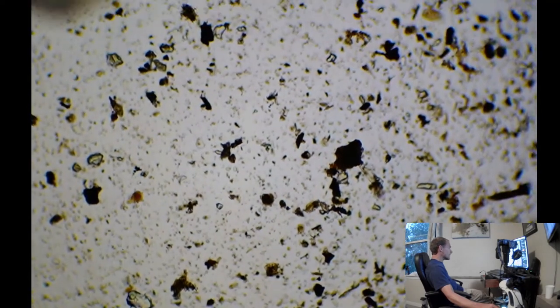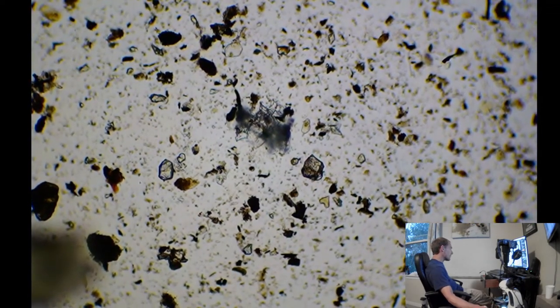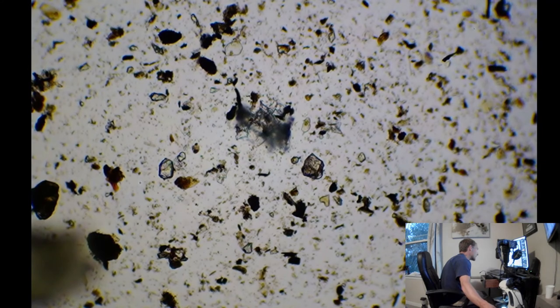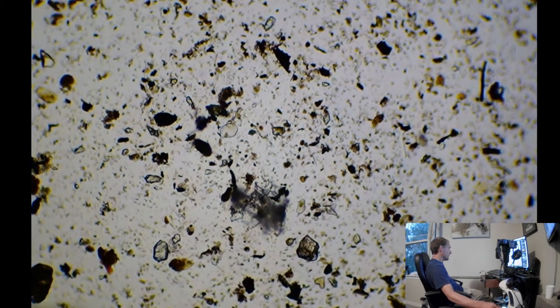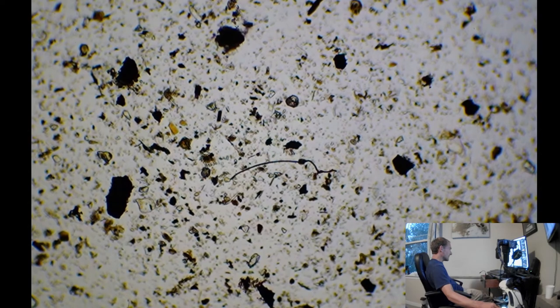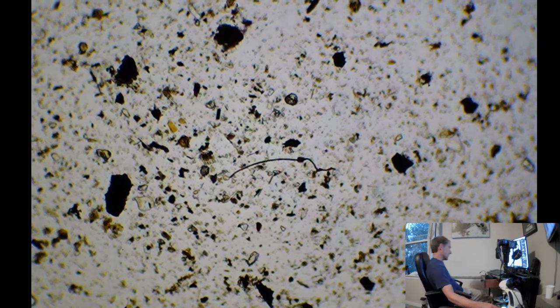Clear strands. It's a weird looking aggregate. Maybe that's a piece of biochar or something. Might be, just guessing because it's black. That is a good looking... That looks like a nice fungal hyphae.